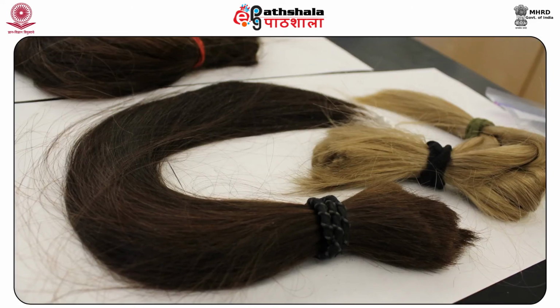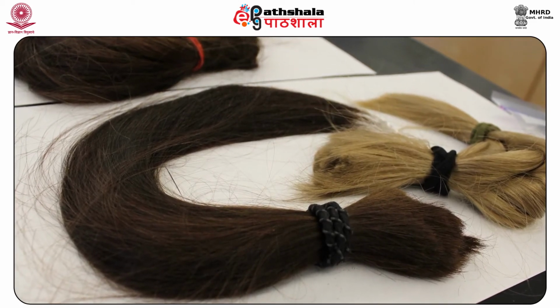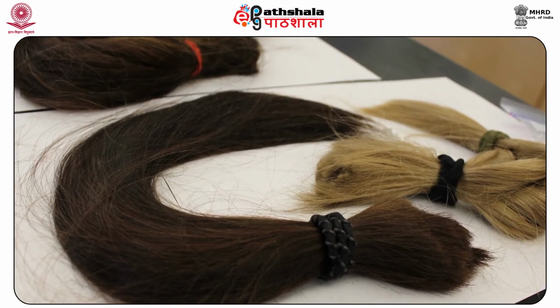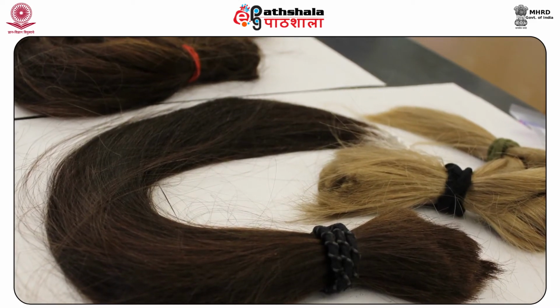The examination reveals the actual color of the hairs. The contamination, which may be masking the real color of the hair, is removed in the cleaning process. Then we can see whether the hairs have been dyed or bleached. The natural color of the hair is found near the root end. The dyed or bleached portion of the hair may be long or short depending upon the period between the dyeing or bleaching and the collection.